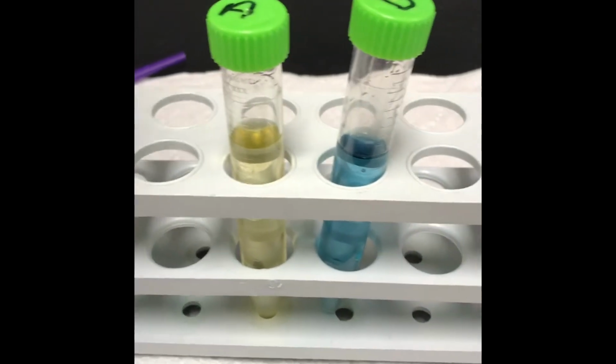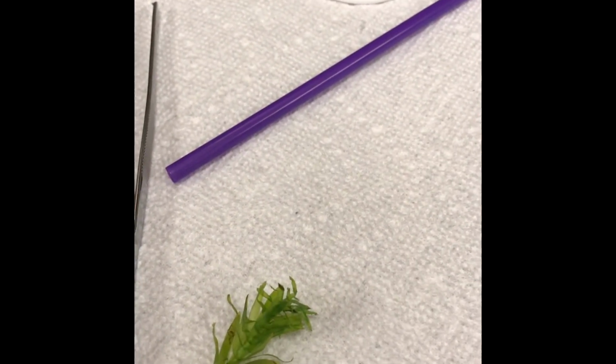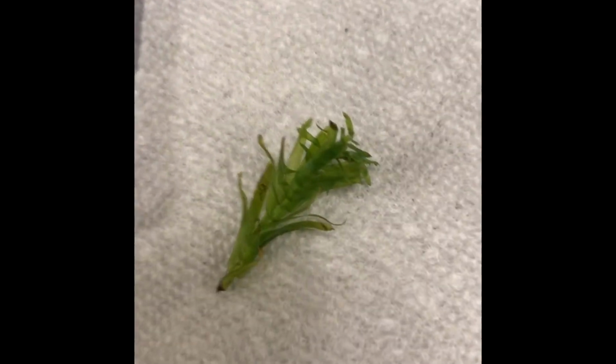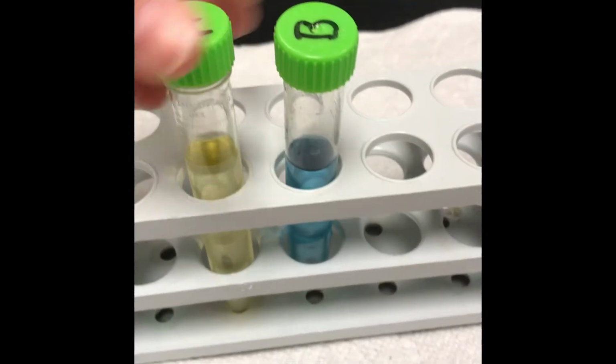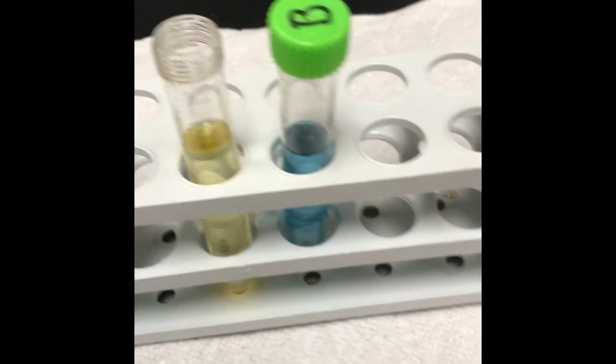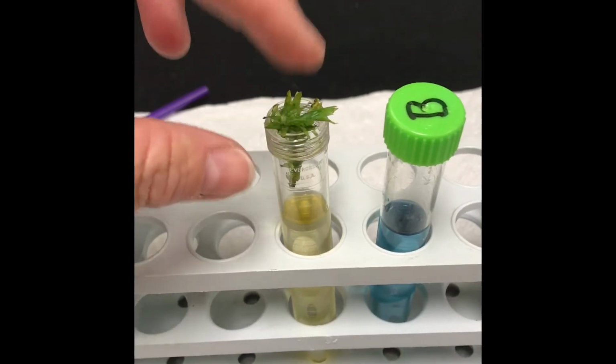All right, so tube A, we are ready to add our Elodea or Anacharis plant. It's actually an Anacharis, but we call it the Elodea stem. So I have it cut right here. It's a little bitty piece. And we're going to take the lid off of tube A, the one that we just blew in, change the color, and we're going to take this and place it into our tube.